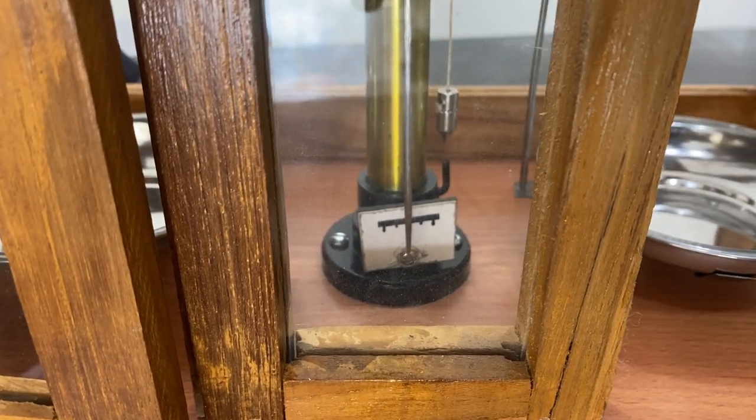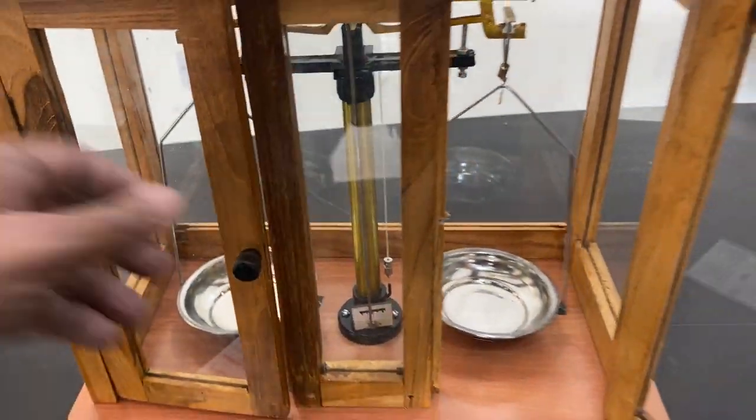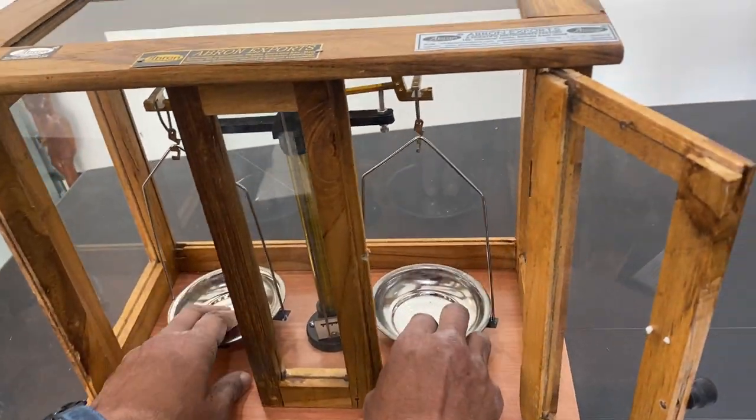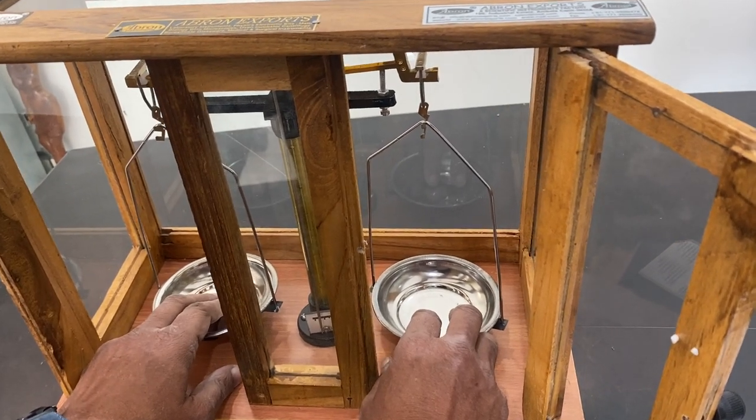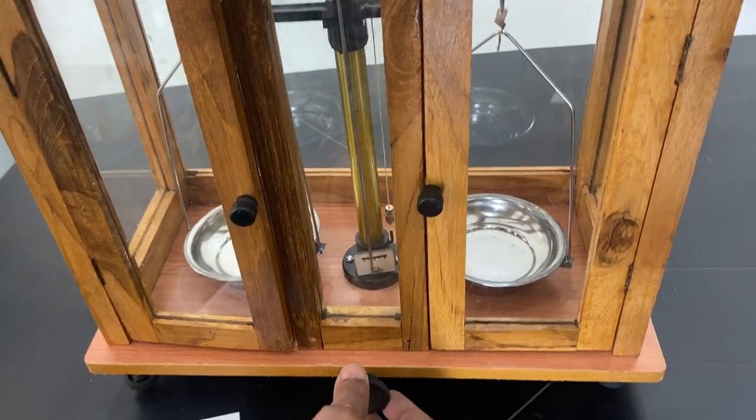Similarly, I move it on the back side as well so that it's exactly on top. Now the balance is ready to work. I stop this movement so there's no disturbance, and then when you lift it, it works.